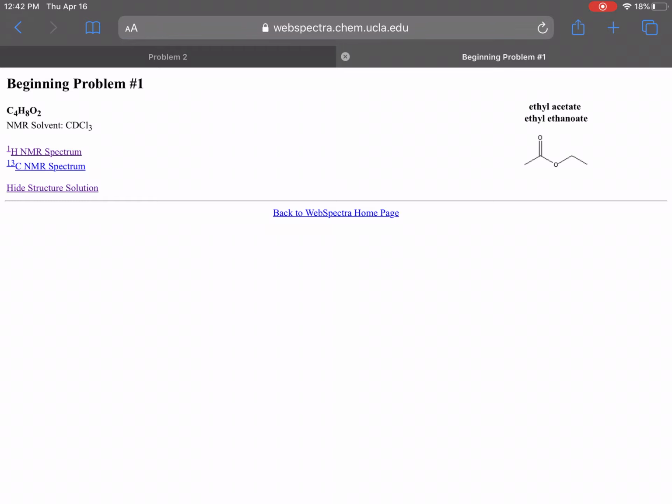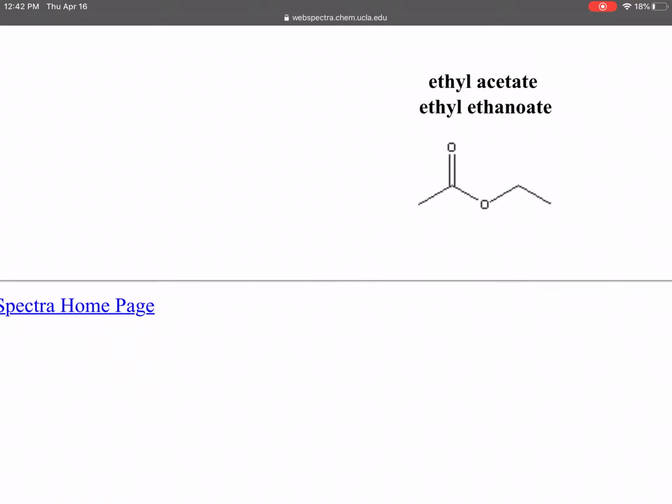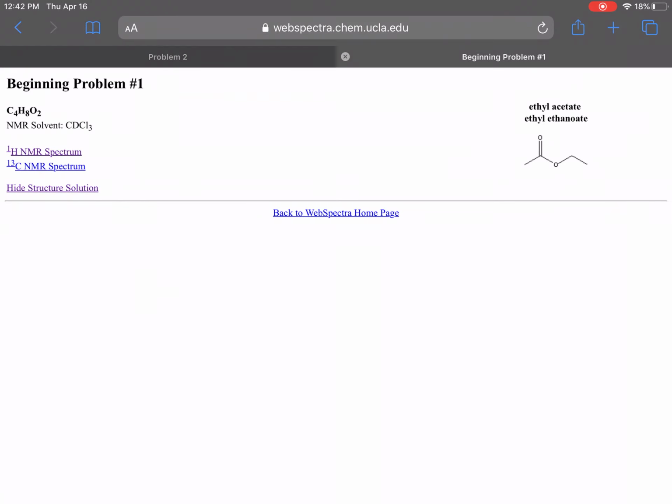And if I look at the answer here, the answer is ethyl acetate, you'll see we have CH3, CO, CH2, CH3. So we do have one carbon with 2 H's and 2 other carbons with 3. So this would actually agree with my analysis, right? So you can see it is very, very possible to make these approximations even if you don't have the integration units.